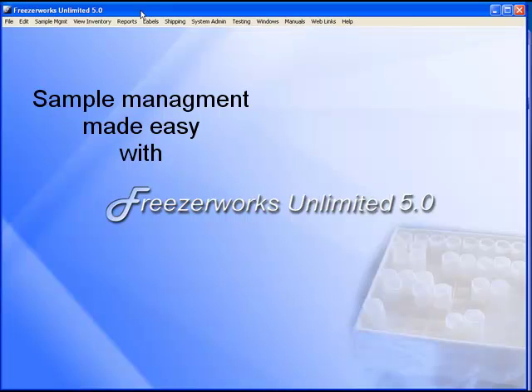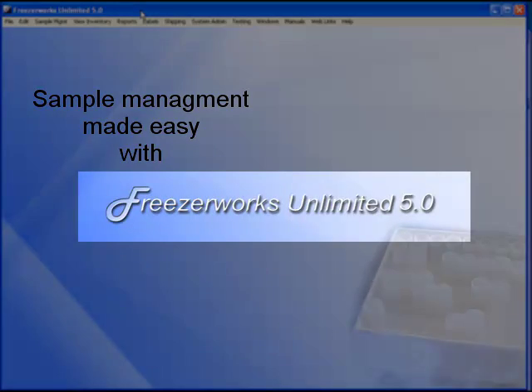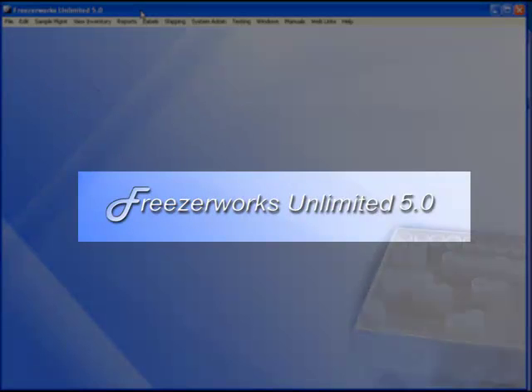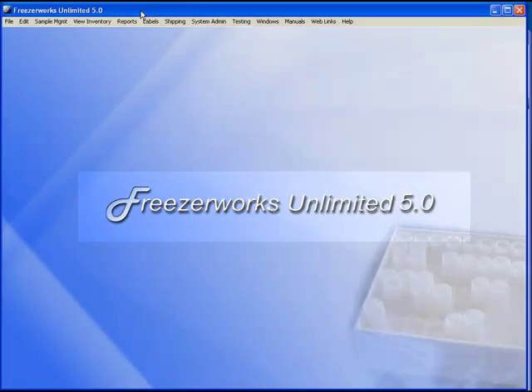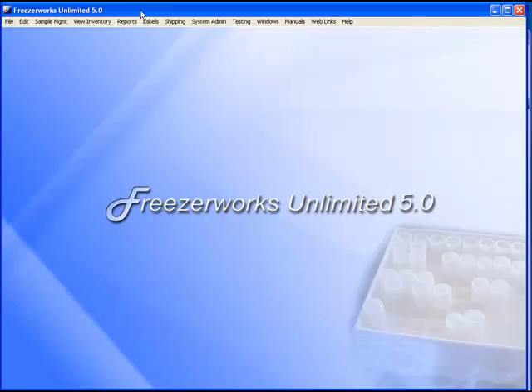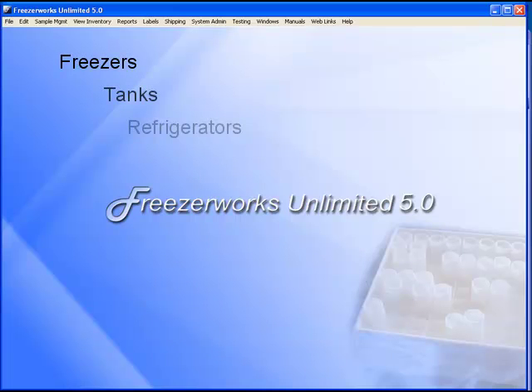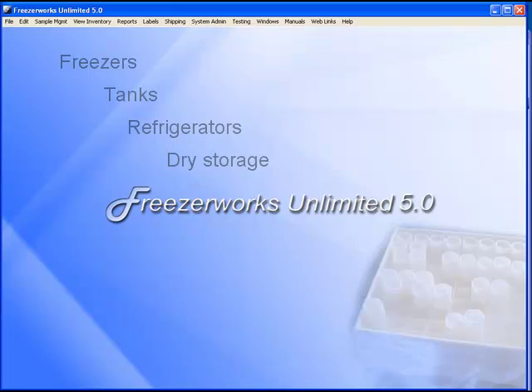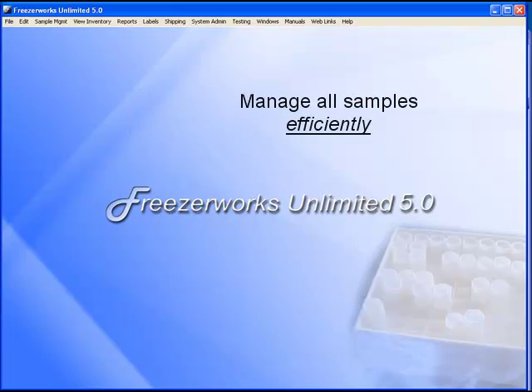With FreezeWorks, you have the tools you need to quickly perform the most time-consuming sample management tasks. Whether your samples are located in freezers, tanks, refrigerators, or dry storage, with FreezeWorks you can locate and manage all samples efficiently.